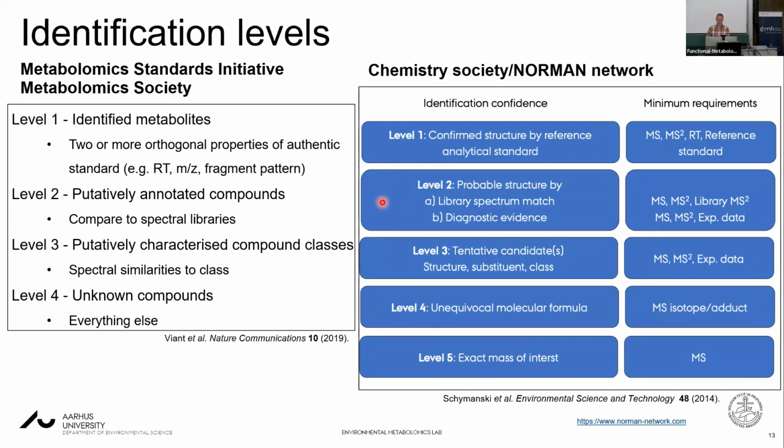And we are only reporting level 1 and level 2 data. And you should be very clear about when you report something, is it level 4 or is it level 3 or is it level 2 or 1 in your studies.